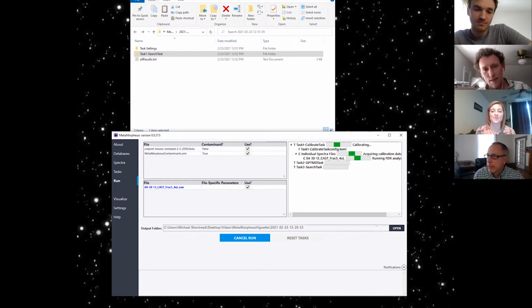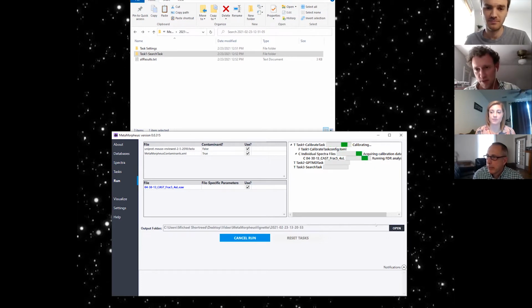Yeah, no, so now if you had done just the search only, so no calibration, no Gptmd, how much quicker would that be than on your laptop? It will be about 5 minutes on my laptop for just the search task. Calibration task takes 12 minutes and Gptmd took 24. Man, you're on it. Yeah.